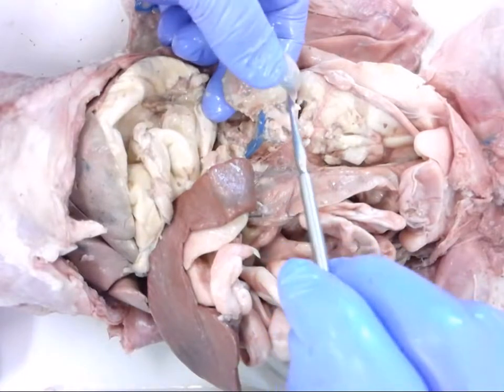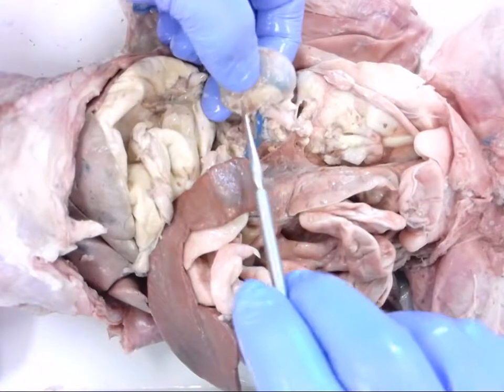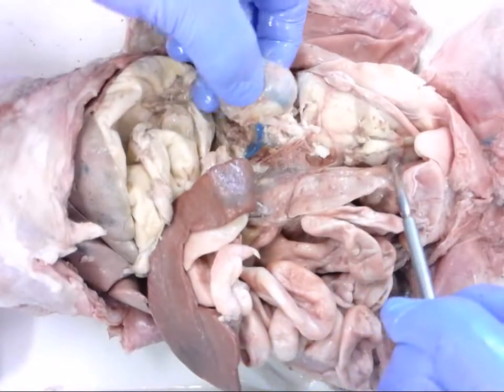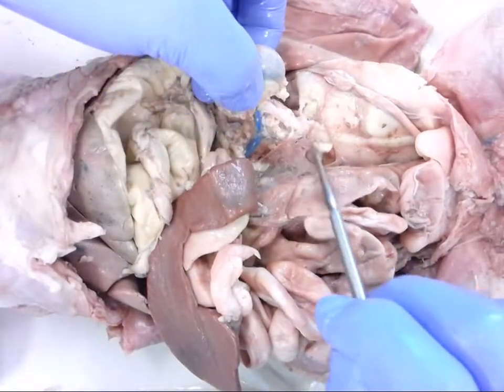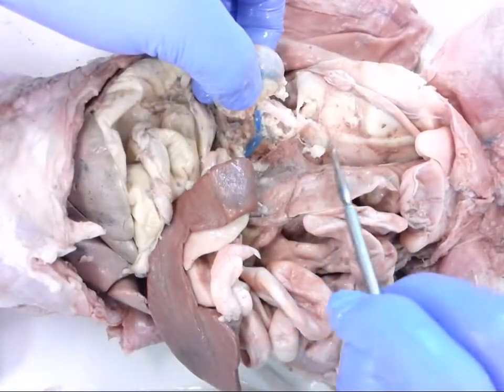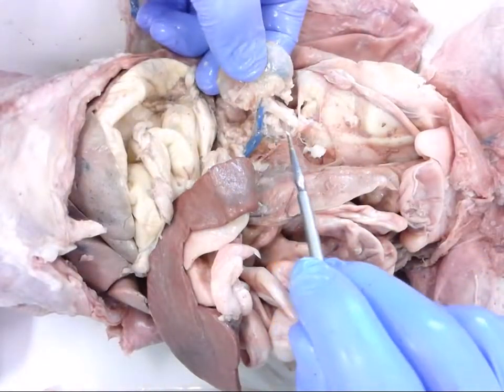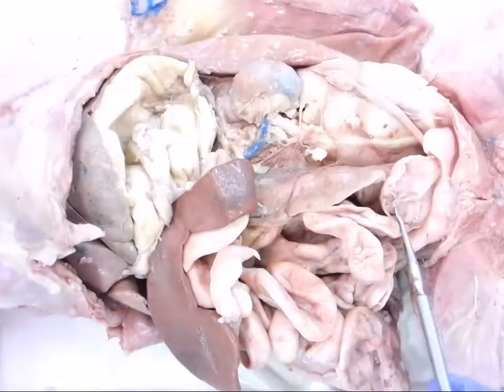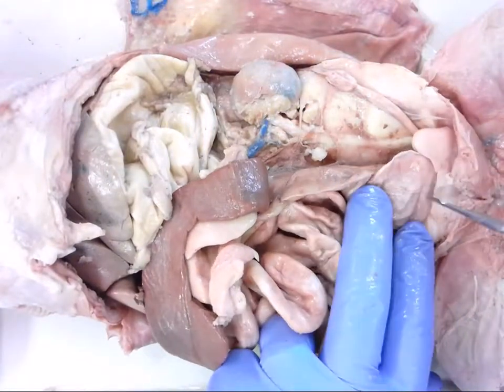Once the kidney is done filtering the blood and making urine, the urine is going to travel down the ureter. I have not dissected this out very well, with a little bit of fat there, because I want to leave some of the components of the reproductive system intact. The ureter comes down here and will work its way to the bladder. This pouch here is empty.